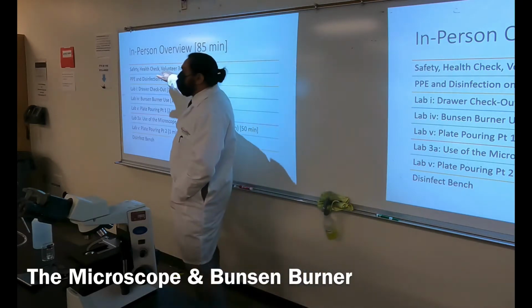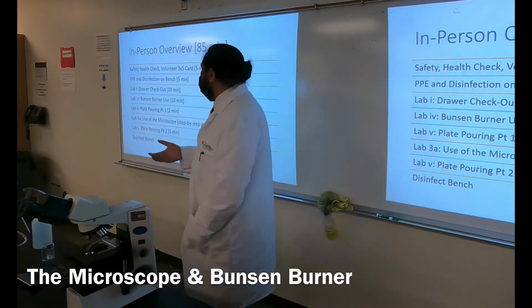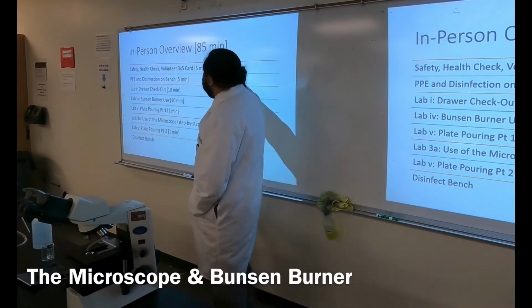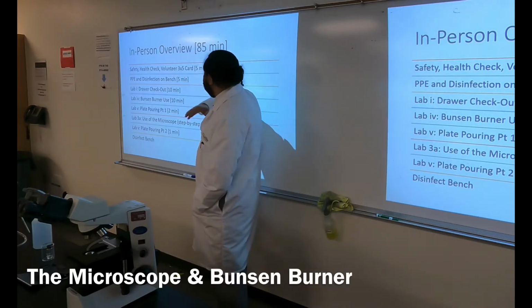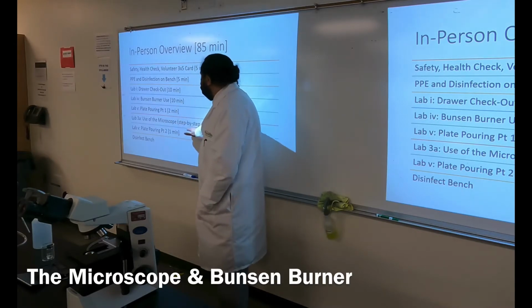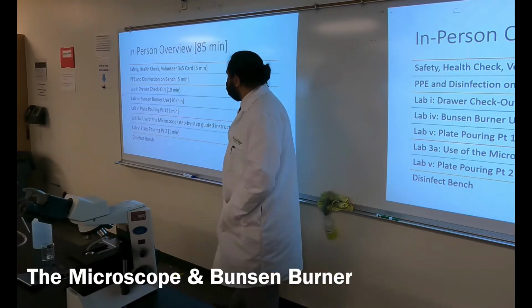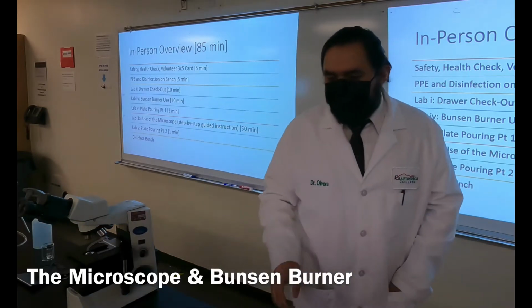We usually do a temperature check at the beginning, so we have that little tiny gun just to make sure, especially during hot days like the summer, and that's about it. Then we want to make sure you're geared up and you're disinfecting your benches. I'll walk you through that. We're going to do the checkout, the burner, the plate pouring, and then we're going to complete the scope for today. And then hopefully, if we have enough time, we'll complete part 2 of the plate pouring.